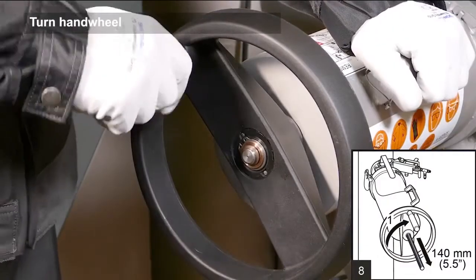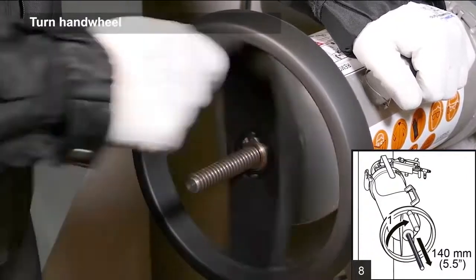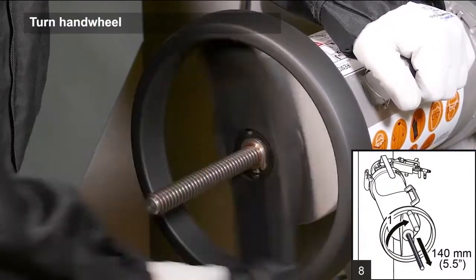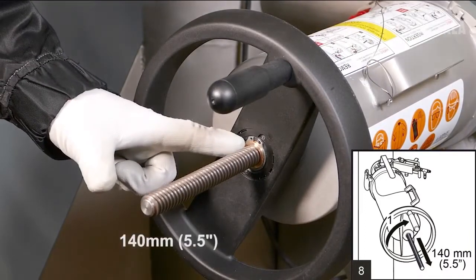To remove the sensor from the process, turn the hand wheel clockwise until it stops. At this stage, about 140mm of the thread should stick out from the middle of the wheel.